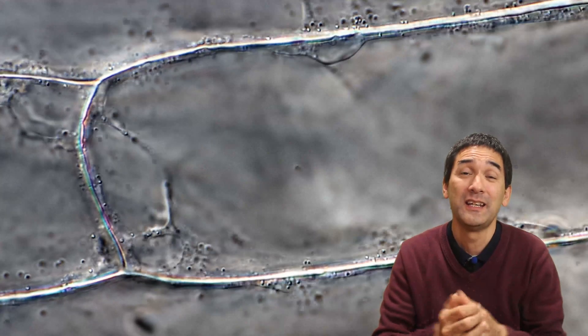But the natural color of those onion cells is actually colorless. Yes, even though these are plant cells, there are no chloroplasts inside the onion. Therefore, what you actually get is a black and white image. For this reason, to make the contrast a little bit better, I added a little bit of color.